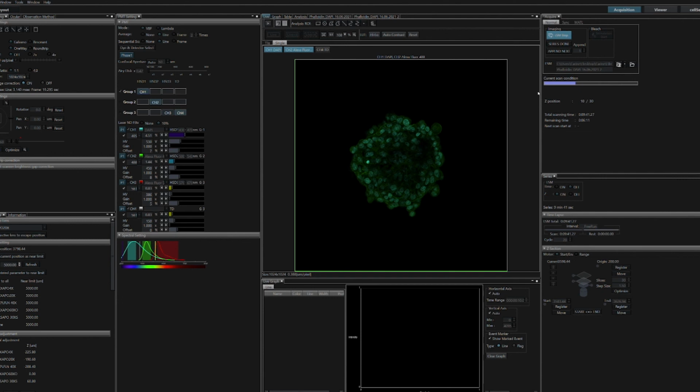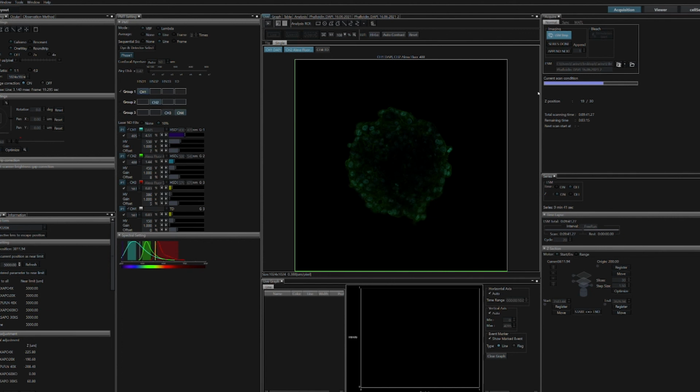Here we show the resulting phalloidin staining at the confocal microscope, and we are showing how the imaging is performed, and you can see this progressive reconstruction of the 3D structure. This, of course, is done for both channels, the phalloidin and the DAPI. So at the end, we can create a merged picture.